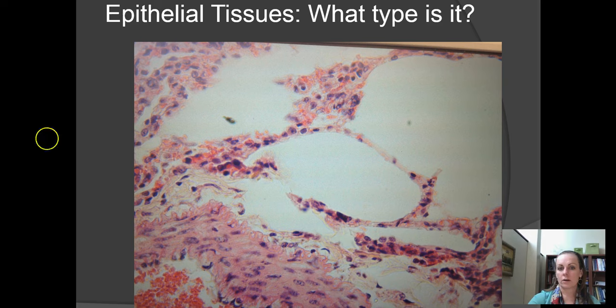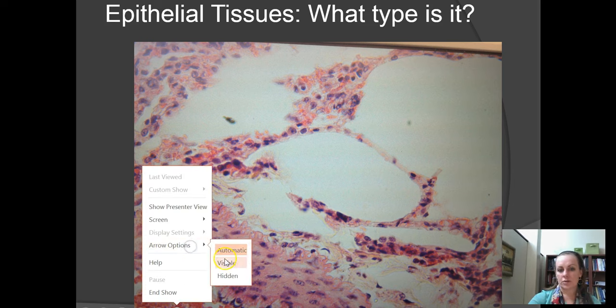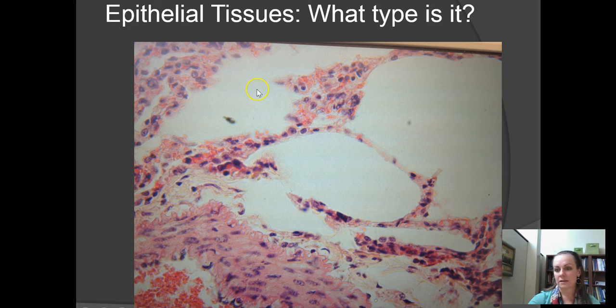And another one that we have here is epithelial tissue. Okay, and for this one, you're going to look at this white space, and we notice some here and here, and it kind of looks round like the glands, but it's not those really pretty regular circular rounds. There's this one squished flat, this one almost looks like a heart. Okay, this is a different type of tissue. This is a lung tissue. And so one of the clues to that is you've got this white space, and it looks like it's surrounded by the epithelial tissue, but it's not a real circle like the glands are.